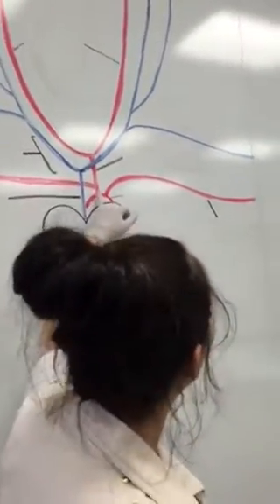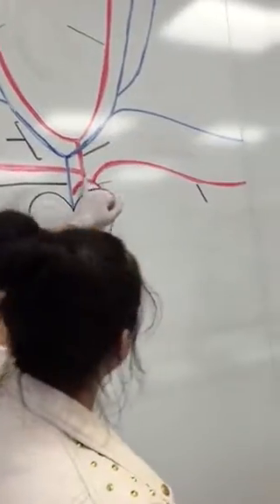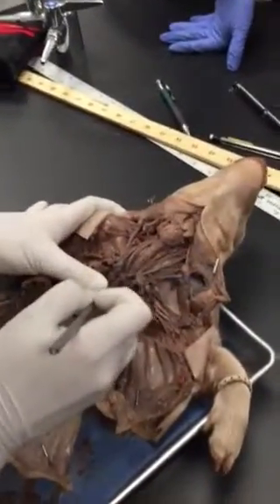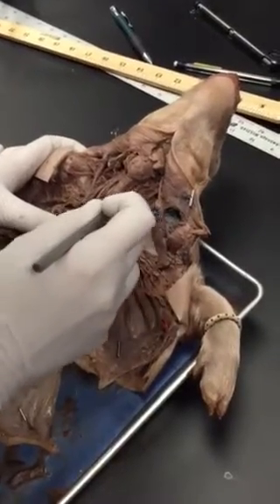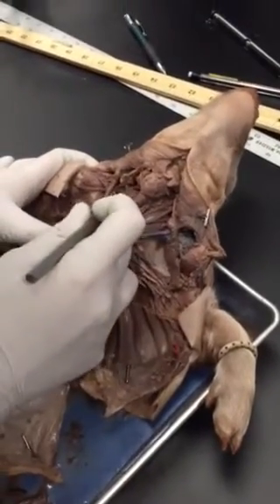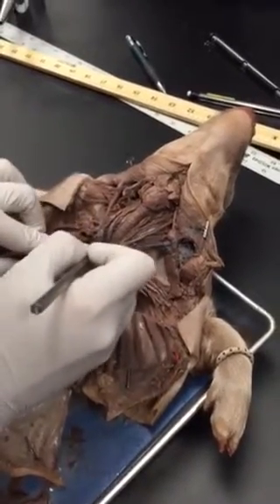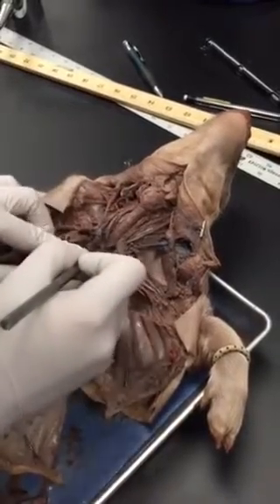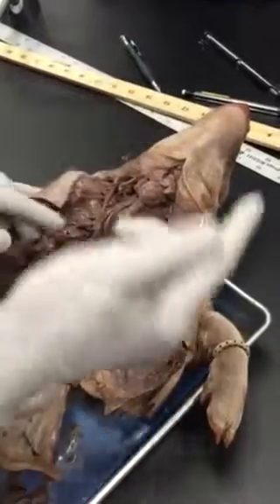Okay, so off of the first extension, we should see one, but two things go up into the neck region, and then also something shoots into the shoulder, right? So let's see if we see that. Okay, so let's follow this. Here's the first extension, and you see, okay, there's one and two things up into the neck region. So these are your carotid arteries. So this part here, behind this vein, right? That's the carotid trunk. So the carotid trunk will turn into your two carotid arteries, okay?